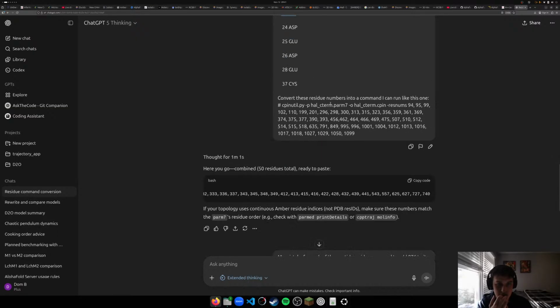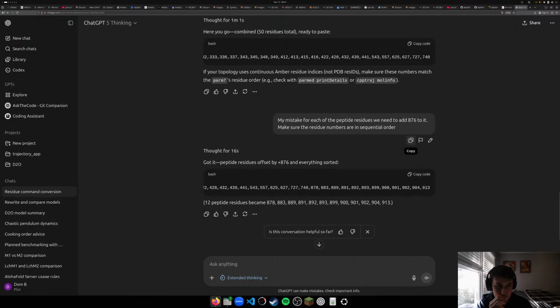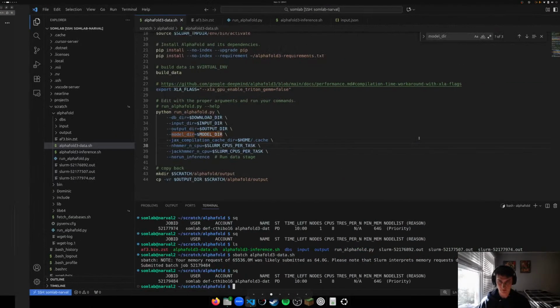So plus 37, that'd be 740. Or no, would that be 913? 7 plus 6, 3, 1. Yeah. All right, I think it worked.